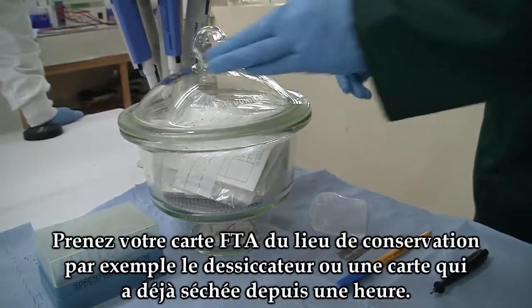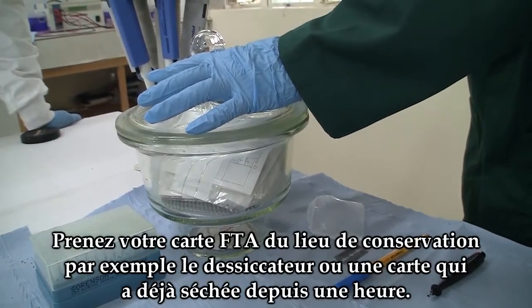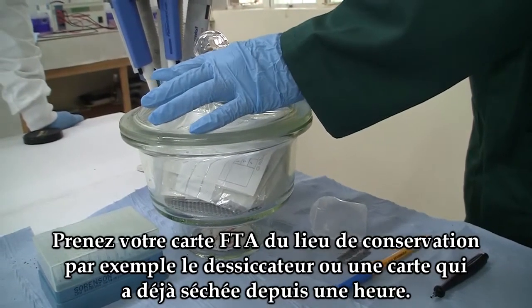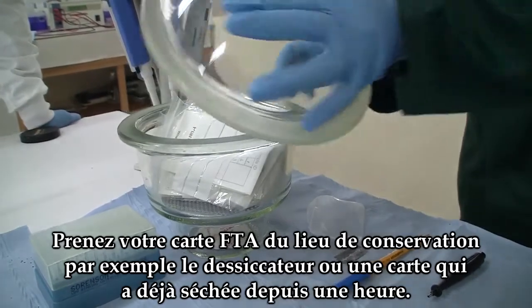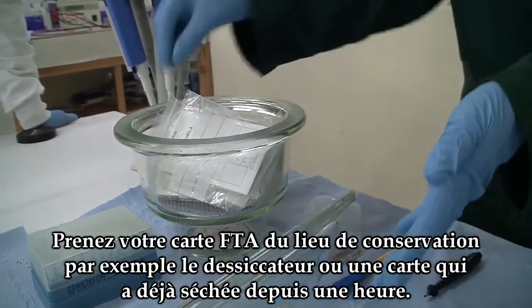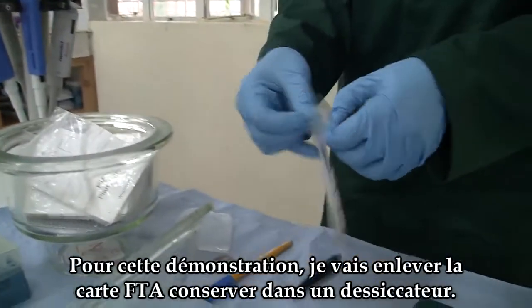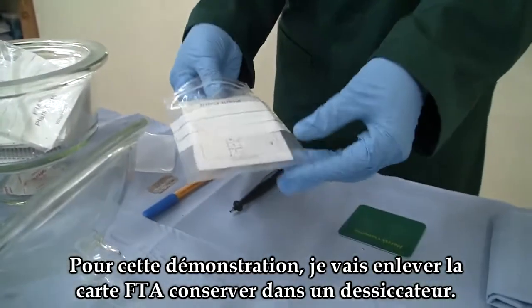Get your FTA card from the stored place, for example the desiccator, or a card that has already dried after one hour. For this case, I'm going to get a stored FTA card from a desiccator.